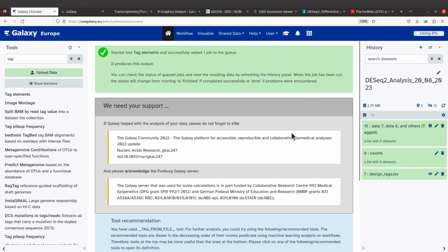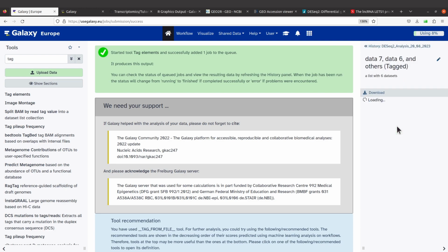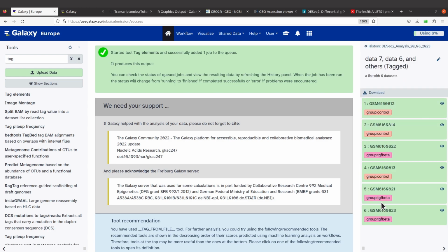Once you do that, check the right side, the data will be generated as output. So this is it. Click it, and when you click it, you will see this coming up with some colors. If you see this, then that means everything is okay. If you don't see this, please check and follow the instructions that I have given. All right, now let's get back.